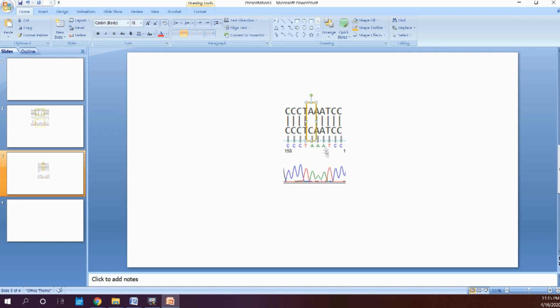And this one corresponds to the A, so copy and paste, show the peak. So just make sure everything's consistent. Another thing you want to do is when you present this, you can either call it the query. That's a bit big, so let me make that a little smaller. Copy and paste. Subject. So that's one option that you have.